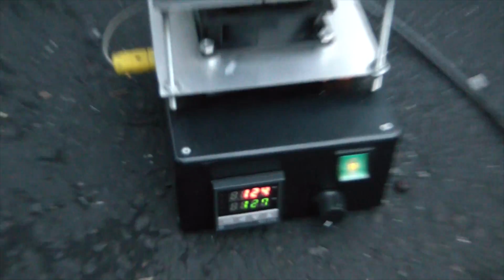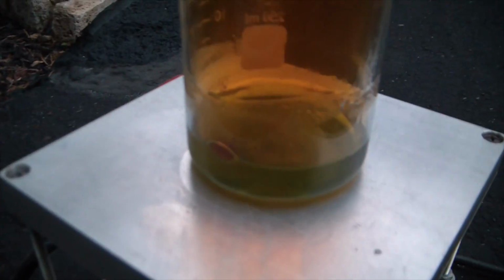The reaction was moving at basically a snail's pace at ambient temperature, so I threw it on the hot plate. And you can see now things are progressing much faster. The quarter is dissolving.